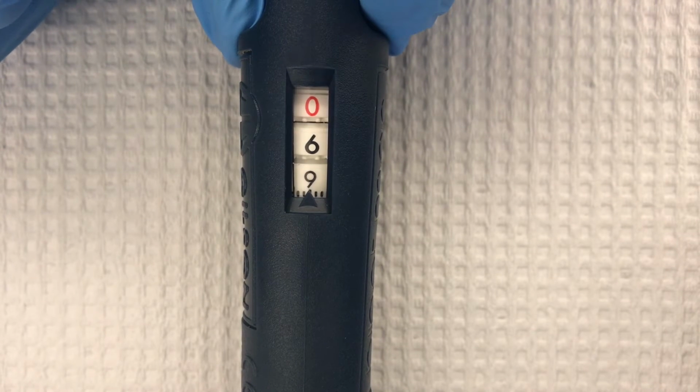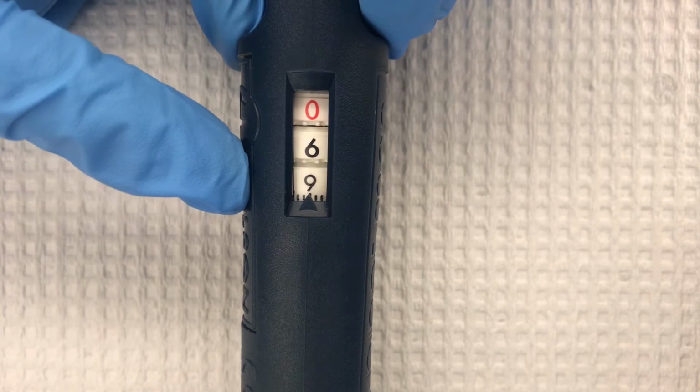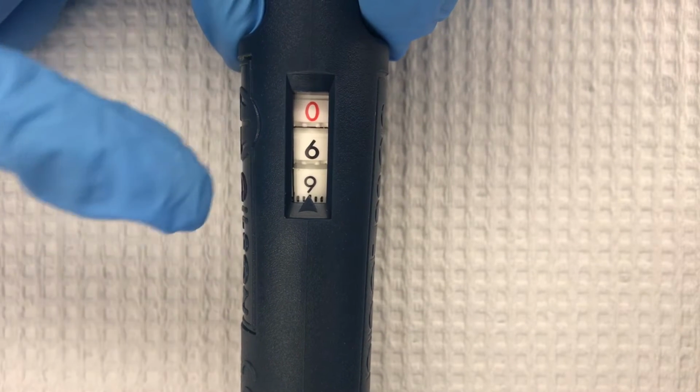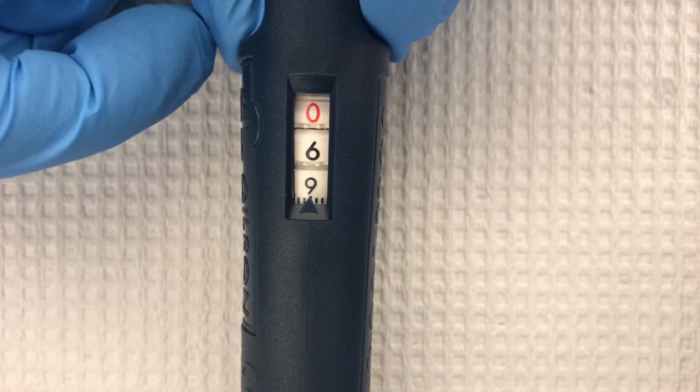This is a P1000. The red digit at the top corresponds to the thousands place. The middle digit corresponds to the hundreds place. The digit at the bottom corresponds to the tens place. This pipette is set to pick up 690 microliters.